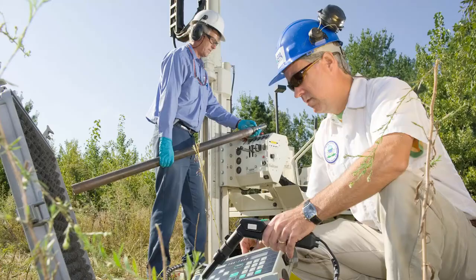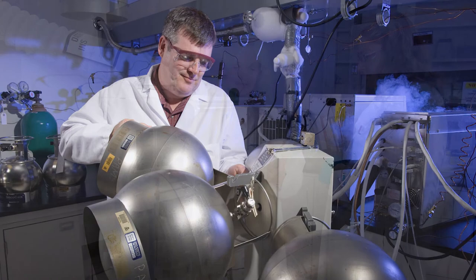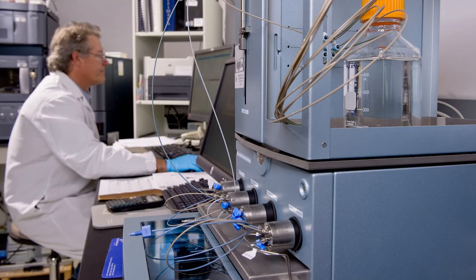It's based on the data that we collect in the field, either through observation or sample analysis and collection. So really to make sure that we have sound data that is defensible, we provide fieldwork, inspections, data analysis, data evaluation and interpretation to make those sound scientific decisions.